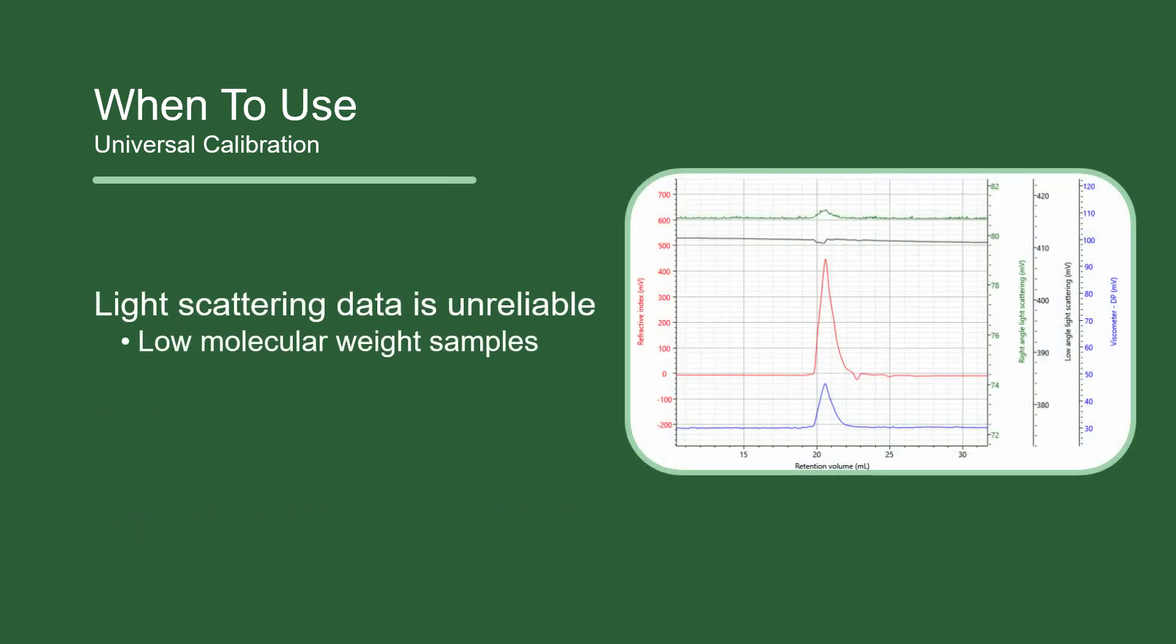Light scattering data can be unreliable for a few reasons. The light scattering response could be weak due to the sample's low molecular weight or low dn/dc value. Universal calibration can be used as an alternative as long as there is sufficient viscometer data.